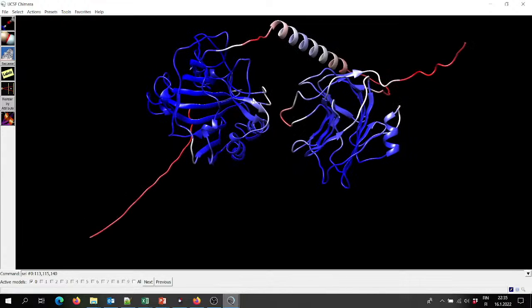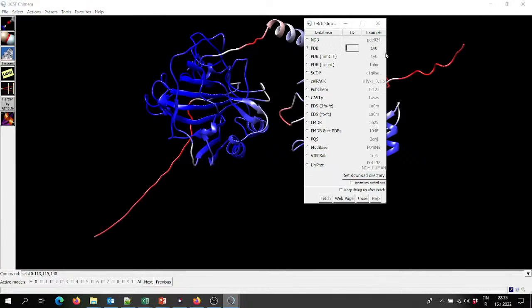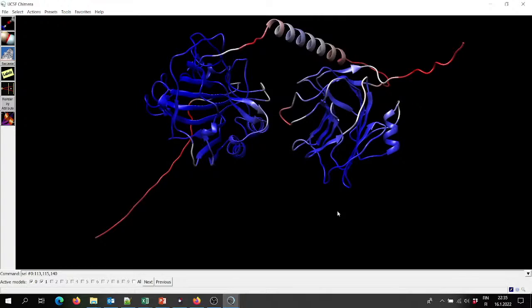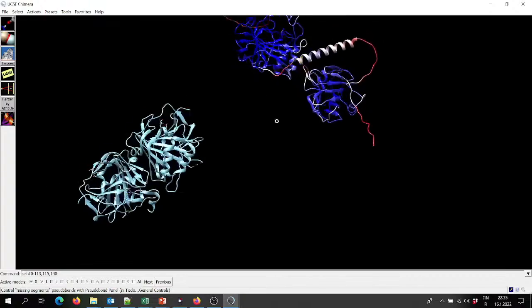And now let's compare this with the CA6 model we have in PDB, human CA6. The PDB code is 3FE4. I fetched this like 50 times before, so we'll get it there. And now you don't see the model because it is totally outside of the screen.